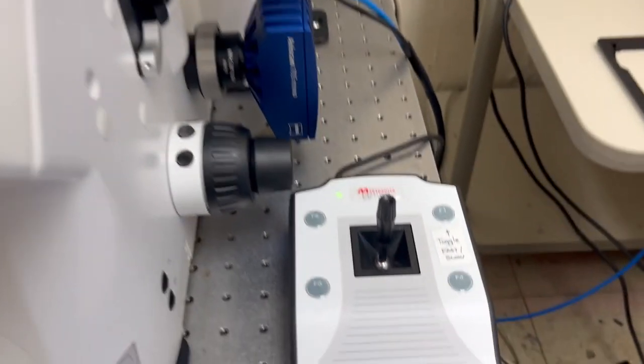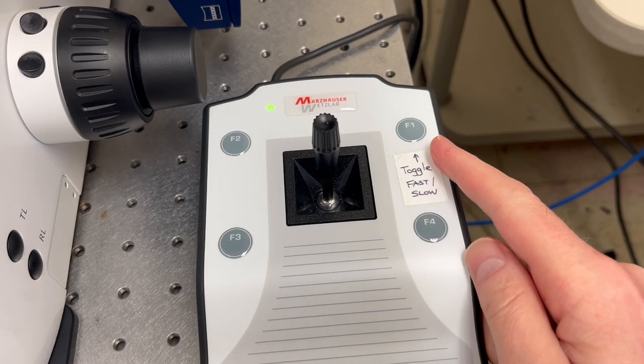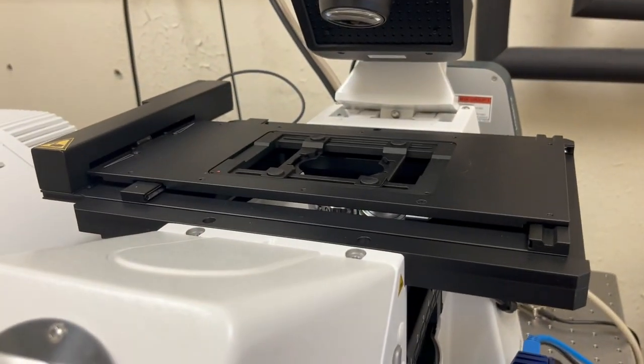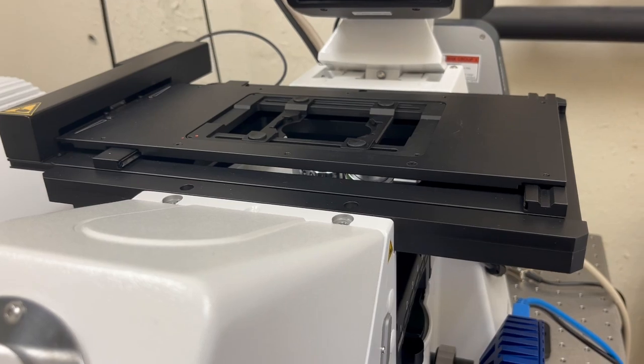The joystick has two modes. By default it starts on fast mode, but if you press this button it is a toggle that will switch it to slow mode. You can see it moves more subtly now.